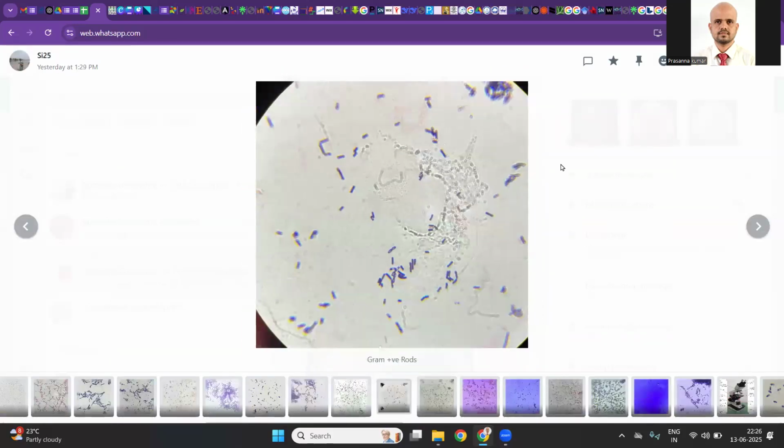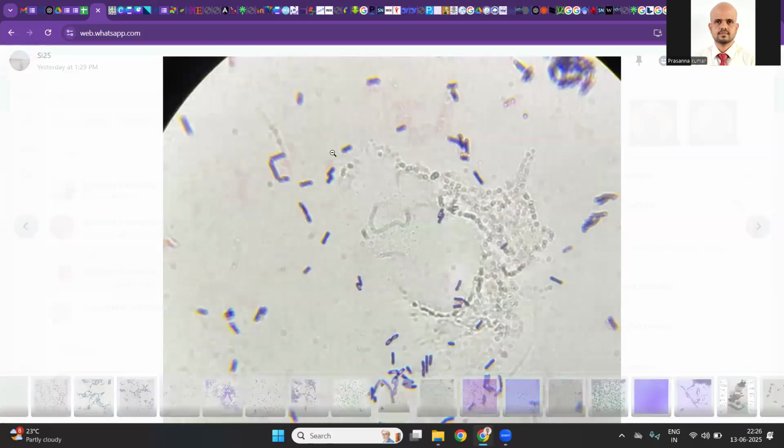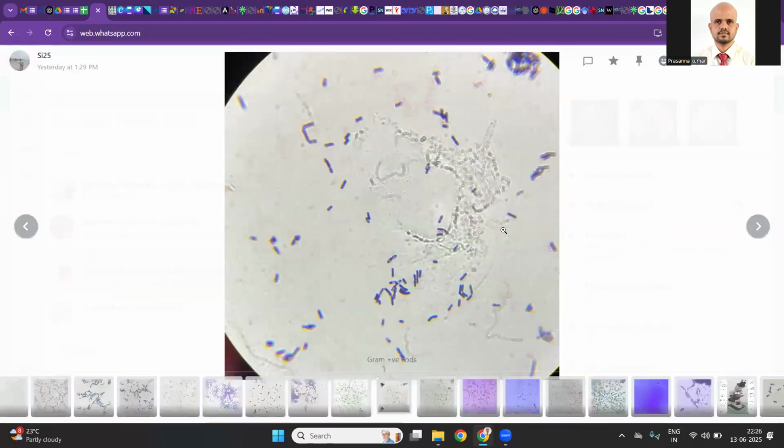See, here is another proof the mobile phone is used. We have this seen through the mobile phone through the eyepiece. We have the black areas here. Better you trim it. Trim this region and have only the core region.